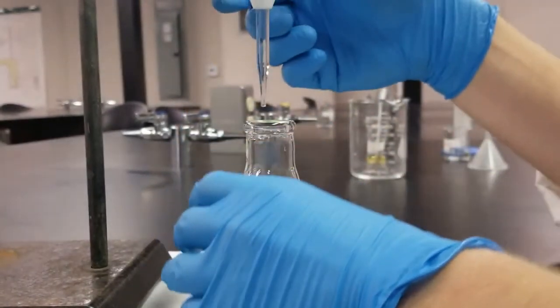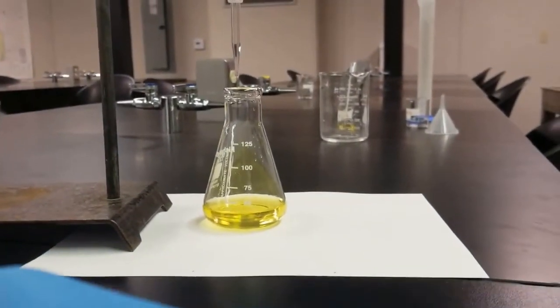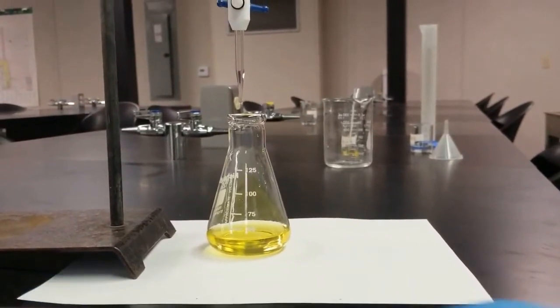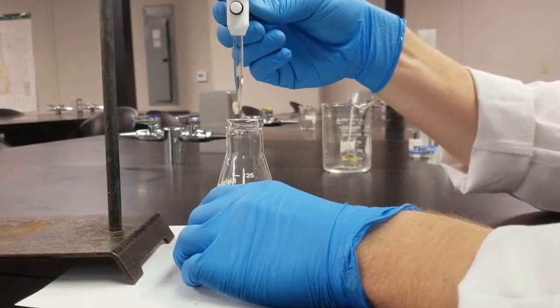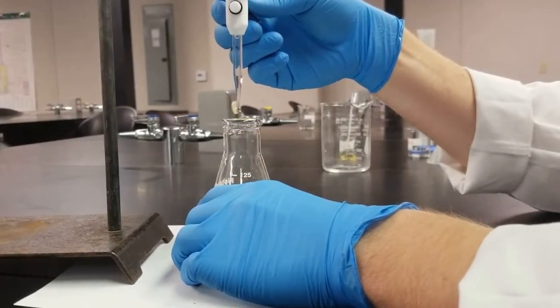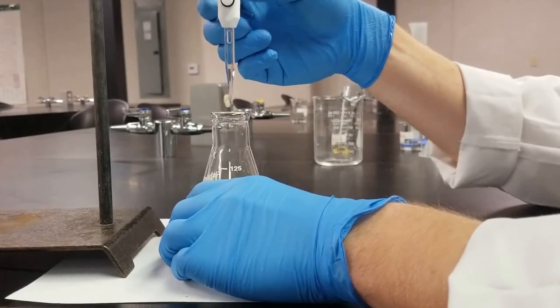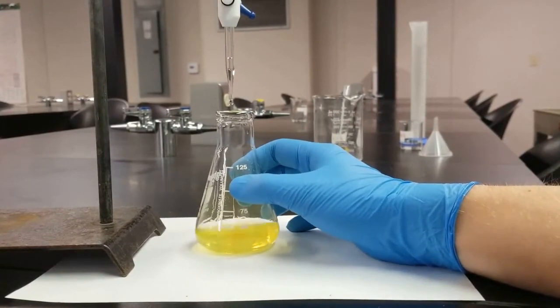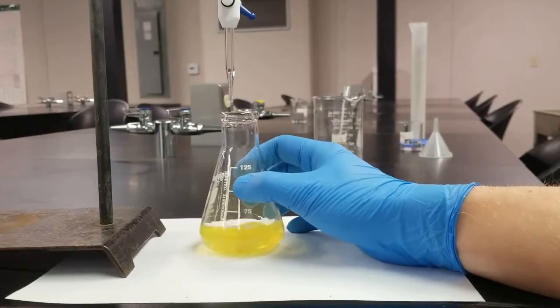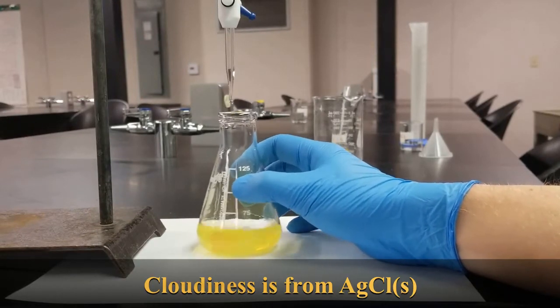So I'm going to open up the stopcock a little bit and try to get this to come out nice and slowly. So you can see, start to add dropwise. You can see the little red down there disappearing away. So once that red stays, that's going to be our endpoint. You can see it's still going away quite rapidly.